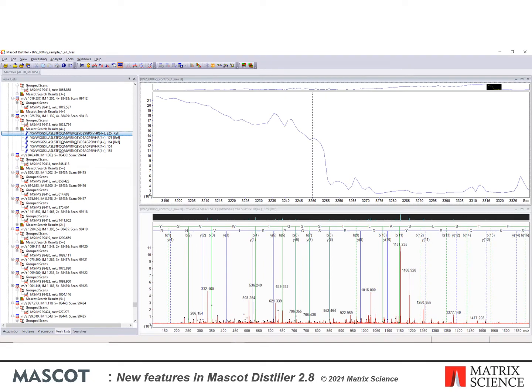Once the TimsTOF data are opened in Distiller they look very similar to other data types within the UI. The main difference you'll notice is that the precursor ion mobility value is shown for the peak lists. Here we have a particularly impressive peptide match from a TimsTOF dataset processed with Mascot Distiller, with an ion score of 325.